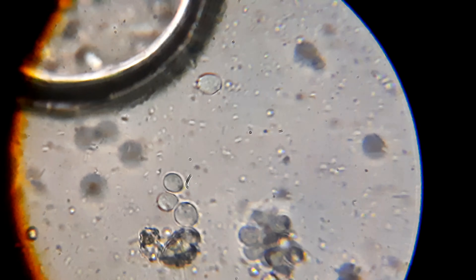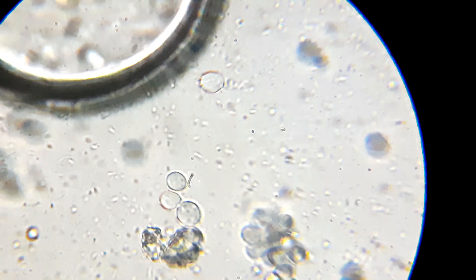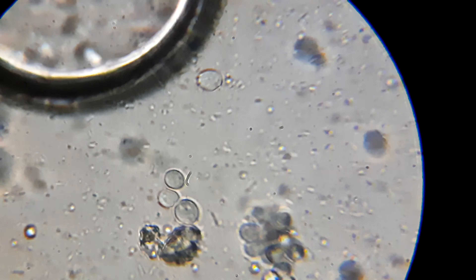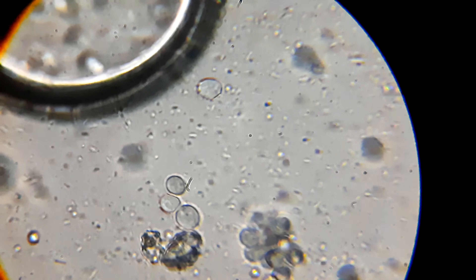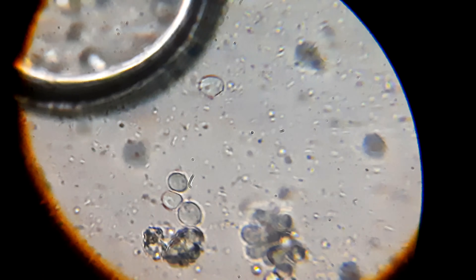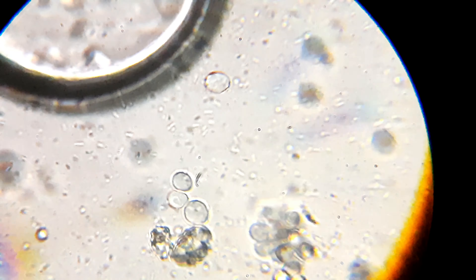You must also be able to view some little structures moving around — those are nothing but bacteria. As I mentioned, I used some nutrition broth which also nourished those bacteria, and they grew out. We were able to view some Bacillus species bacteria, some cocci, and a lot more.